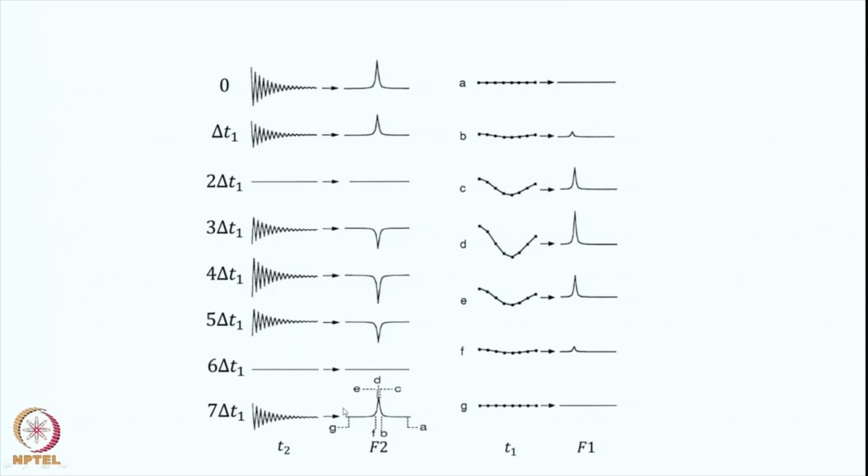Now let us look at this in more detail. This is the spectrum here. Now what you do, this is all digital, right. So when you do a Fourier transformation, you get a digital spectrum. The spectrum is drawn as a continuous analog signal, but actually appears as a digital spectrum. There are points 1, 2, 3, 4, 5, various points are there. Now we will pick up a few of those points here.